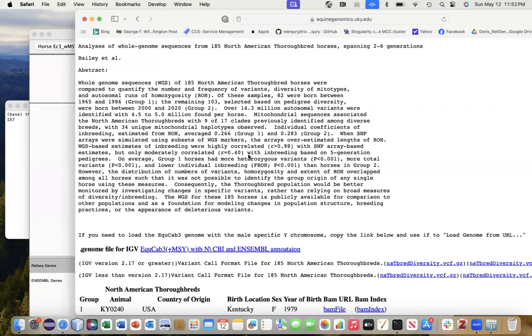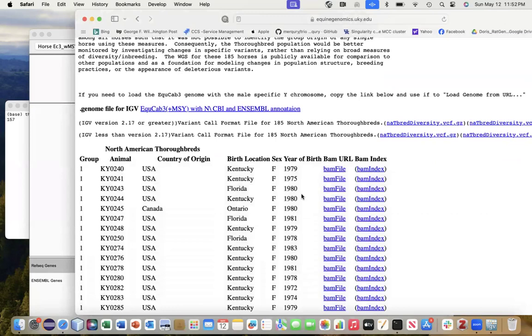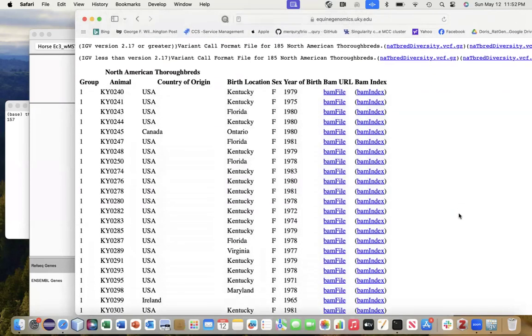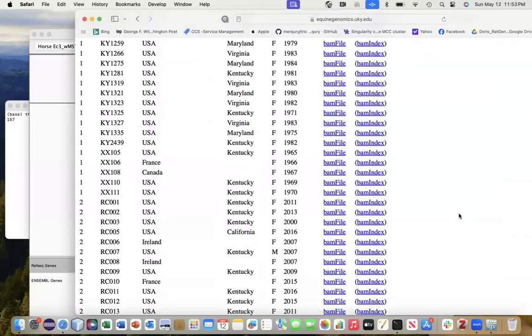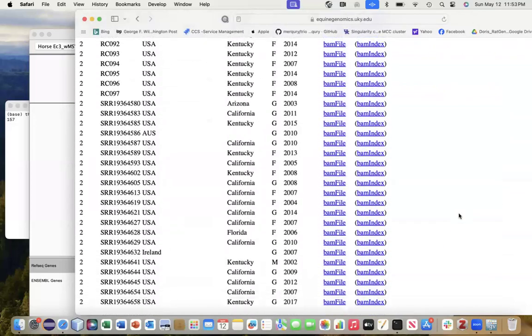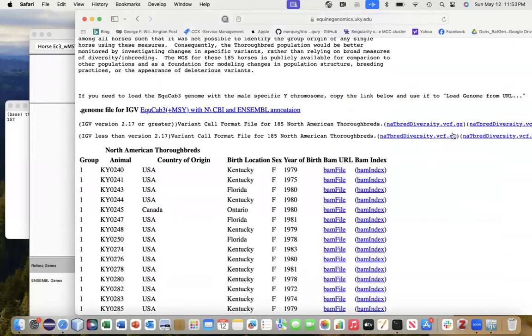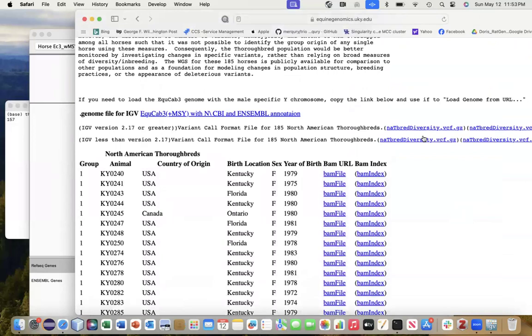Clicking on that will take you to a page that has the title and abstract of a manuscript that was recently submitted by Dr. Jessica Peterson. Below that are the VCF file and the BAM files that were generated by the WAGS pipeline developed by Dr. Jonah Cullen that built that VCF file.